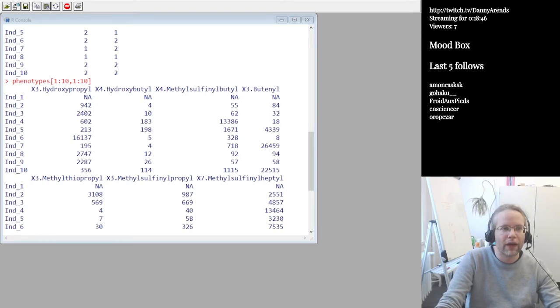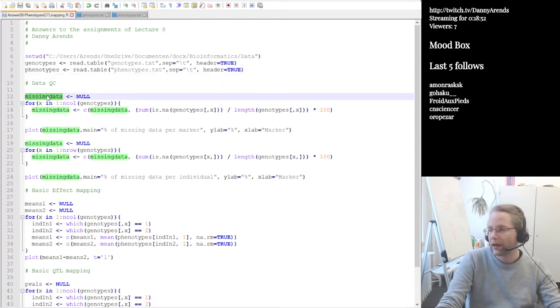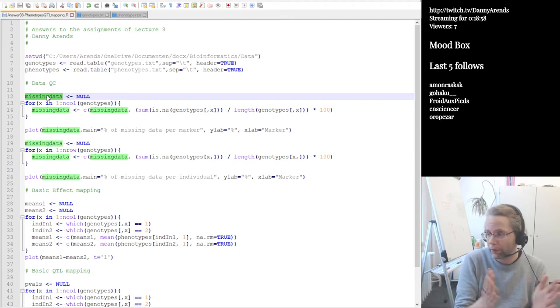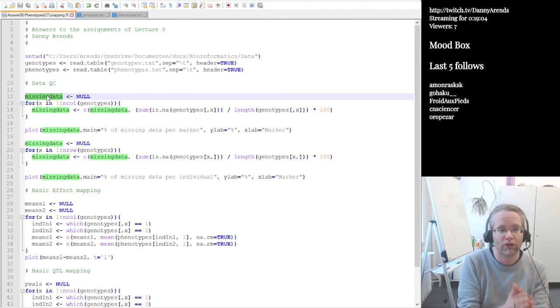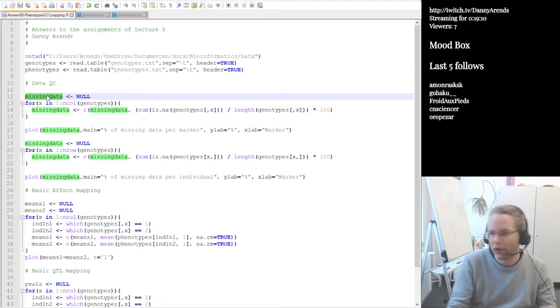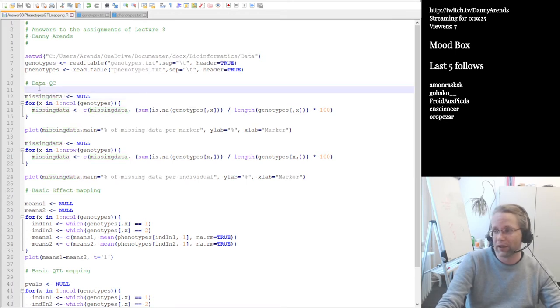The first task is figuring out the amount of missing data. We create an empty variable called missing_data to store results. Then for x in 1 to the number of columns of the genotype matrix, we go through each marker. The code is a one-liner: the new missing_data is a combination of what we already had plus the calculated percentage. We take column x from genotypes, apply is.na — which returns TRUE/FALSE for every individual — sum it up since TRUE equals one and FALSE equals zero, then divide by the length and multiply by 100 to get the percentage. Annoying helicopters aside, the logic is straightforward.